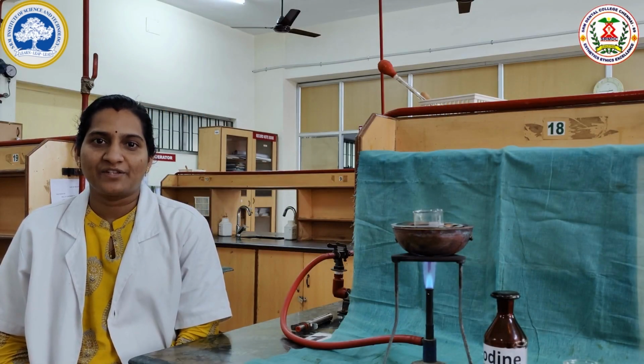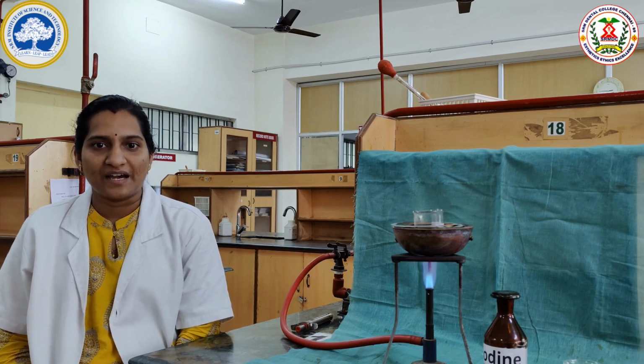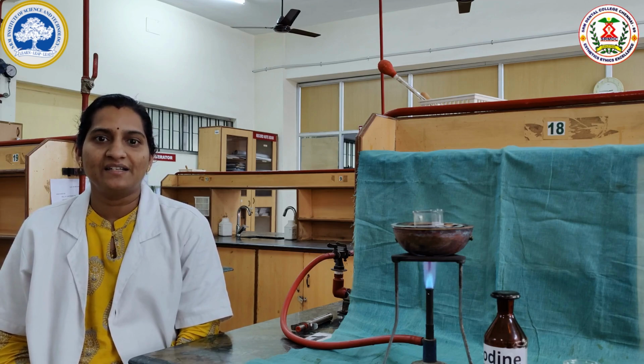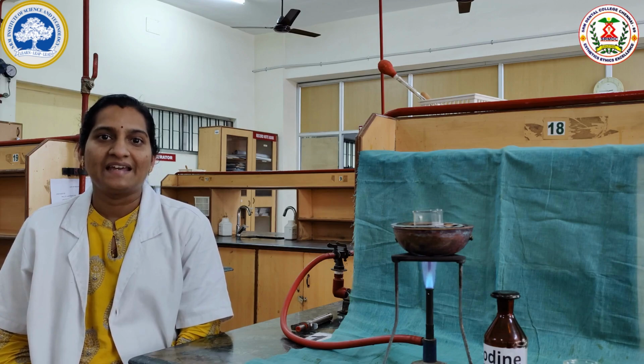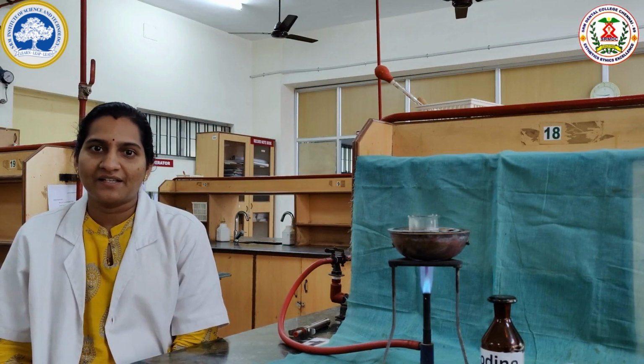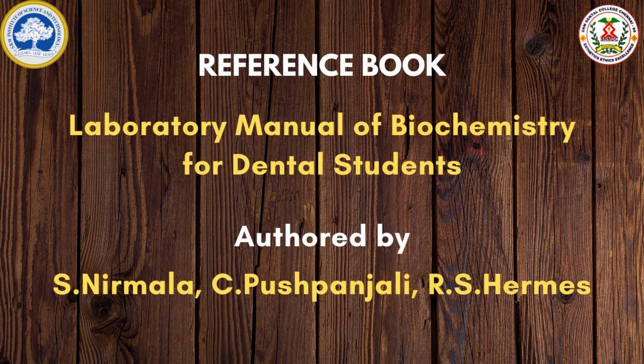With the preliminary tests, we conclude that starch is a polysaccharide and non-reducing carbohydrate. On hydrolysis with HCl, starch will finally form glucose. The course of hydrolysis of starch is periodically tested with iodine solution, which shows formation of various dextrins. Each dextrin will form various colors. After complete hydrolysis, we conclude starch is formed of glucose, an aldose sugar, by doing Benedict's and Seliwanoff's tests. Thank you.